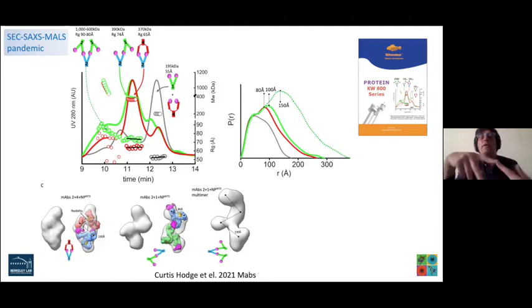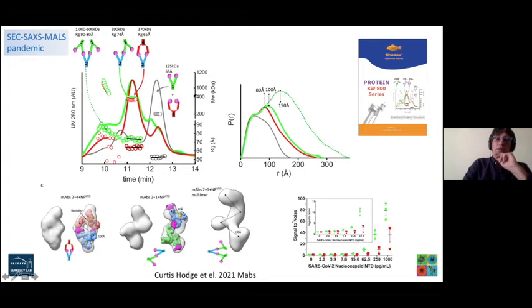And so when you have this kind of sandwich type interaction, you cannot increase the signal, versus when you have very rigid antibodies, they form more linear conformers because they cannot adopt the sandwich-like conformations. And that pushes us toward detecting lower concentrations of nucleocapsid by using rigid antibodies. So it's not only the epitope recognition, but also the general flexibility and dynamics of antibodies that matter.